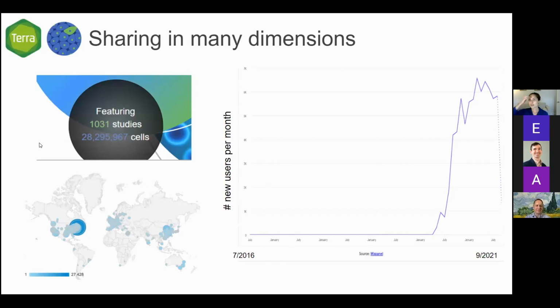And now is a really exciting time to be working with SCP because we're increasingly getting more and more data and now have a really rich set that come from researchers all over the world. And I think that you might find that there's a lot of value to accessing that richness, which both gives you a broad audience for sharing your data and gives you the opportunity to discover some really cool data that are hard to find when you're just looking for them piecemeal.